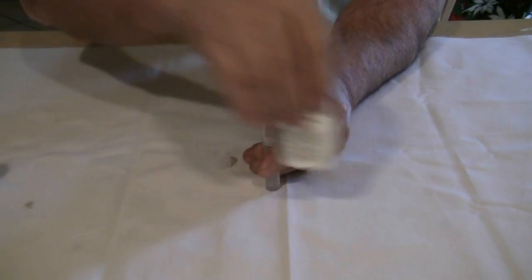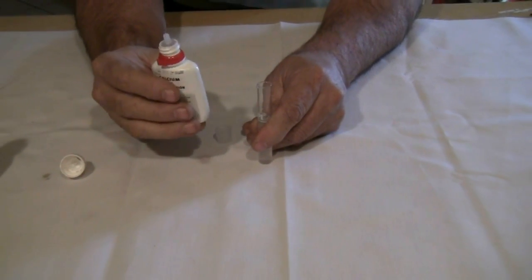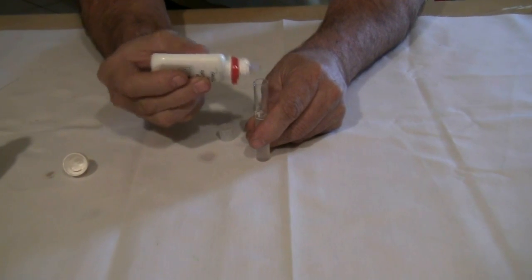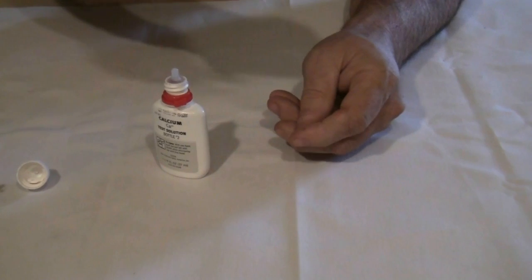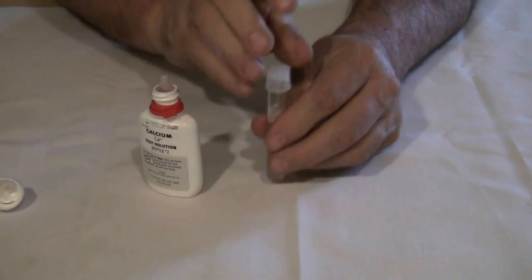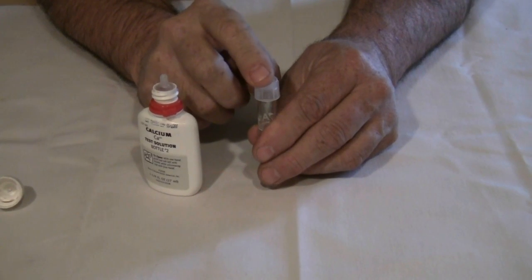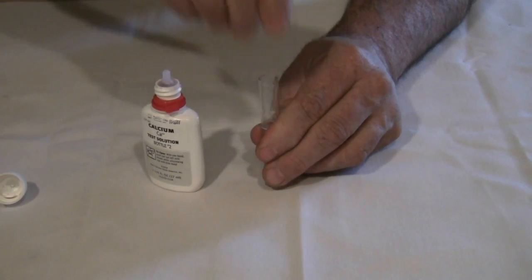Now we are to add solution number two one drop at a time, shaking between drops. One drop, shake. Never use your finger — always replace the cap. The chemicals on your finger may react with the chemicals used for your test.